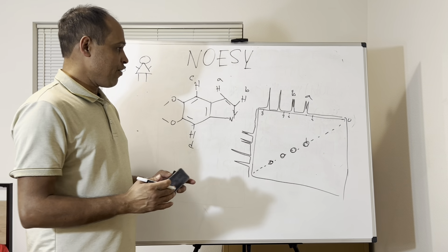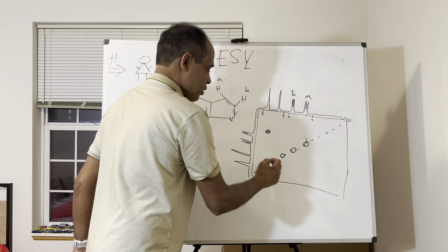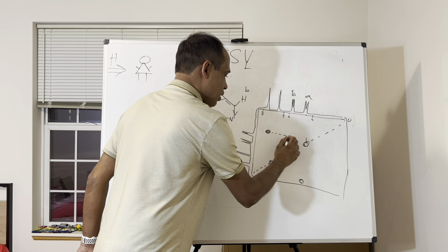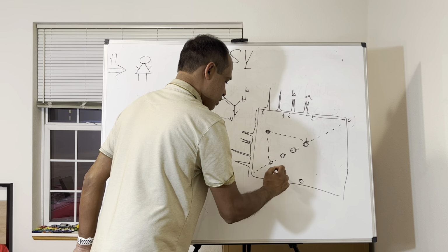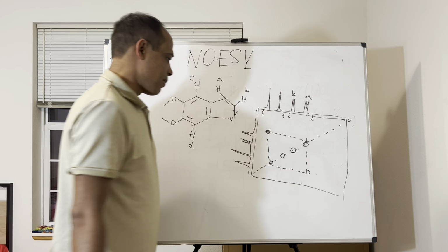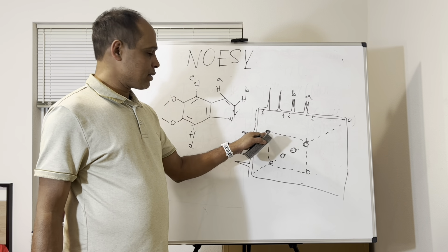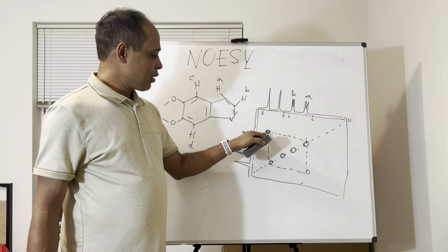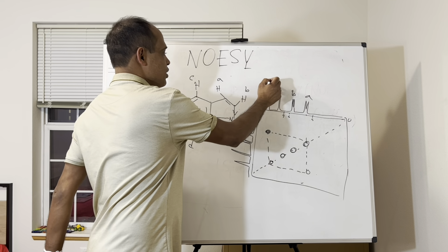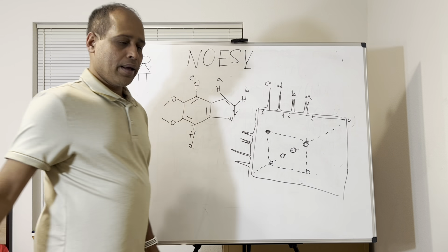Now, if you see any cross peak here and also a cross peak here, that means you can make a relation with this. Sorry, it's too far. That means this A proton is somehow making an interaction or communication with this singlet proton. So in that case, you can say C, and ultimately the other one will be D.